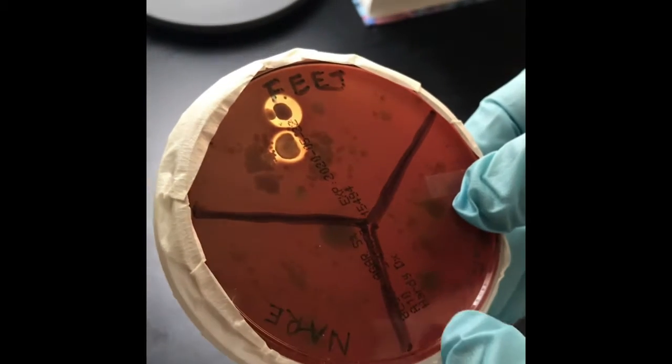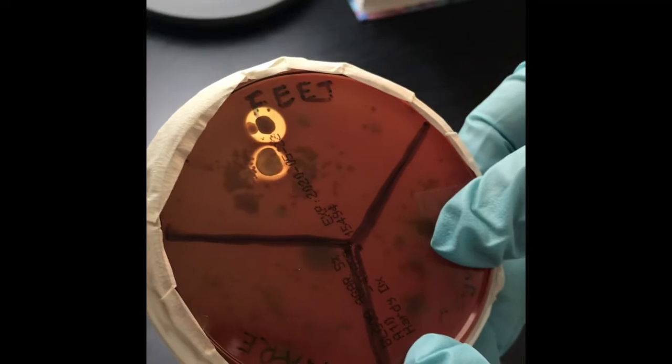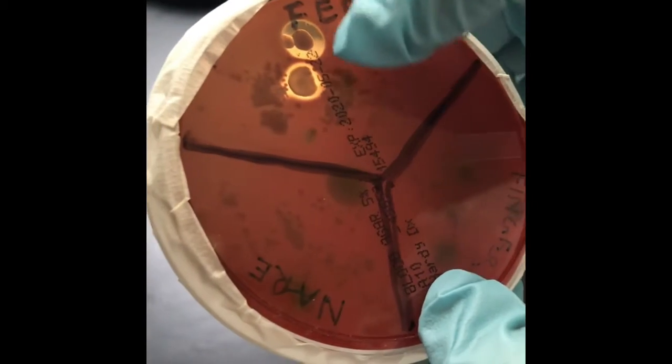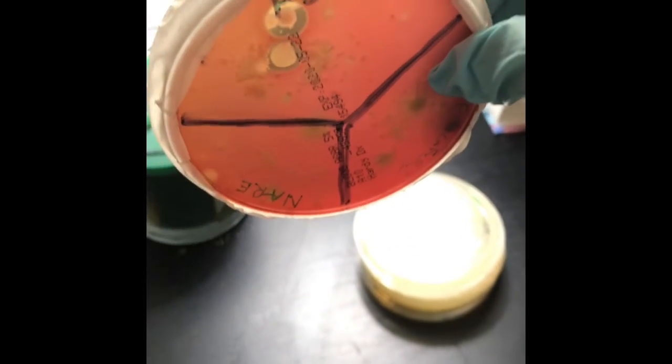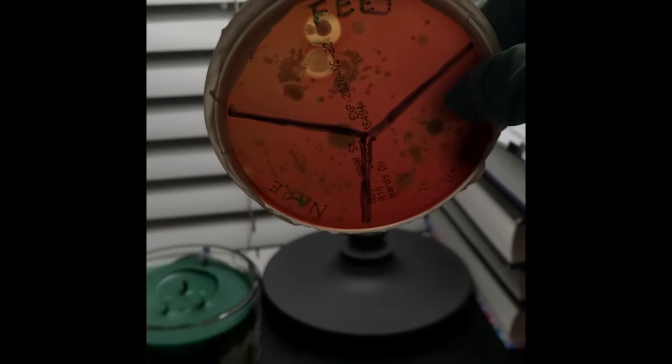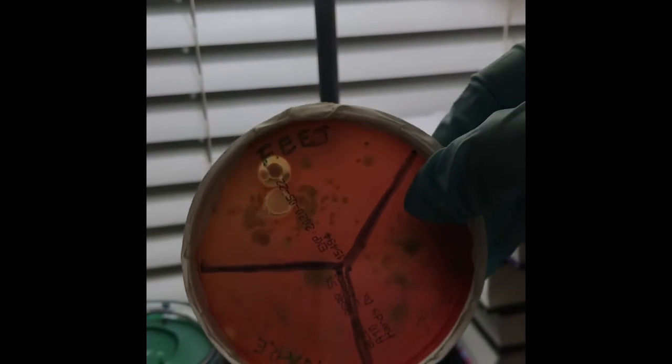You can see that especially on the feet, as I'm holding, light is passing through. This is showing the beta hemolysis. Can you see that? Let me show you. How can you see that light is passing through? Okay, is it clear? I don't know. Okay, maybe this is good.